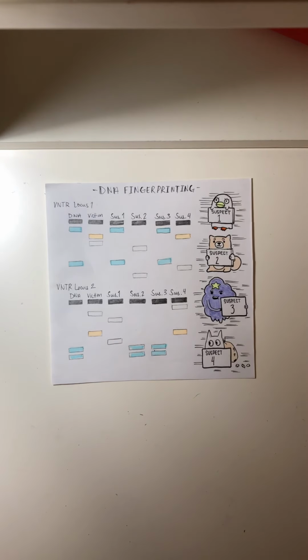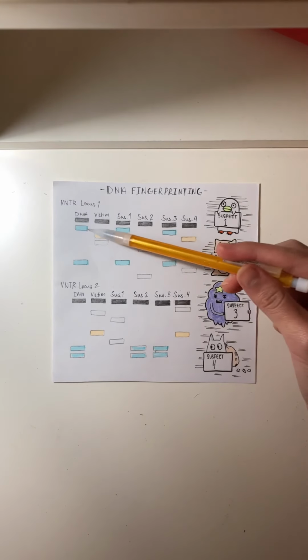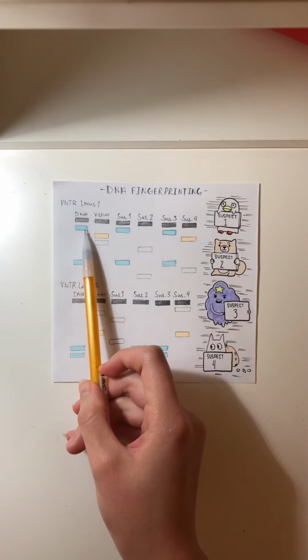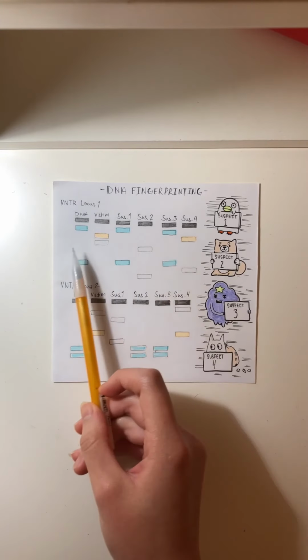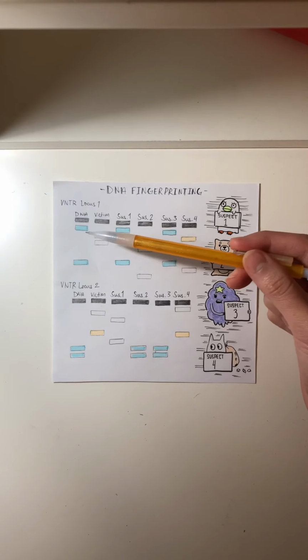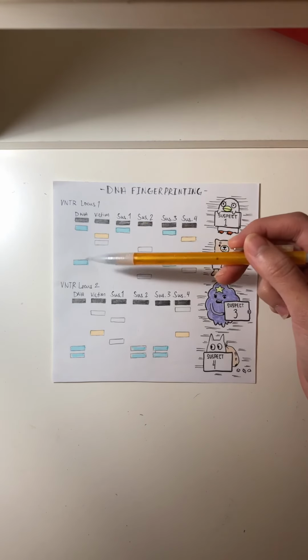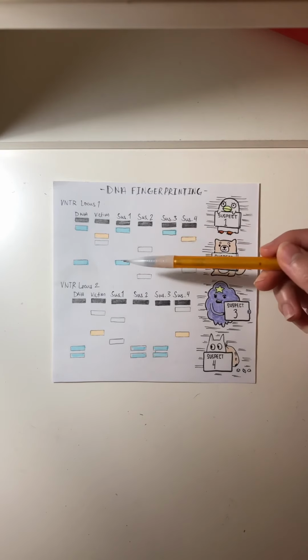at it now. And so in our first VNTR locus, what we're really looking for is an overlap in the bands, shown in blue, which I've color-coded, and then looking at, for example, the DNA that Kermit collected right here, and our suspect 1, you can see that it is a match, the bands overlap.